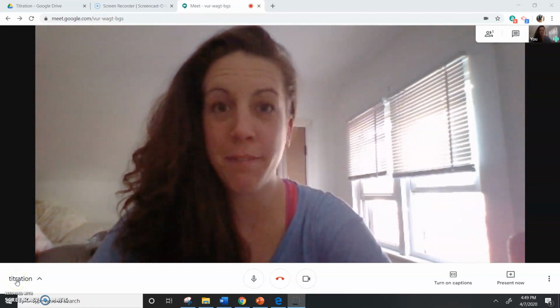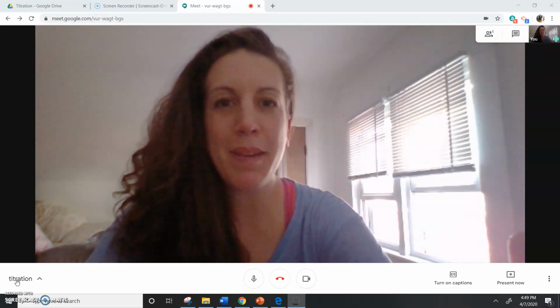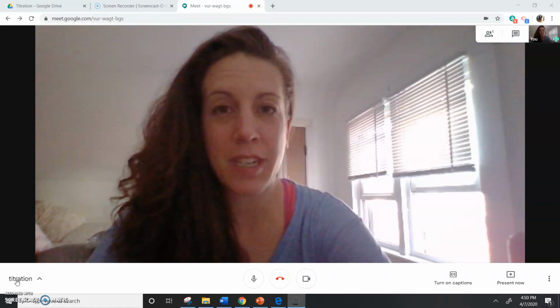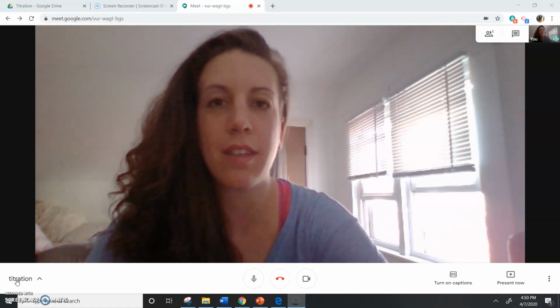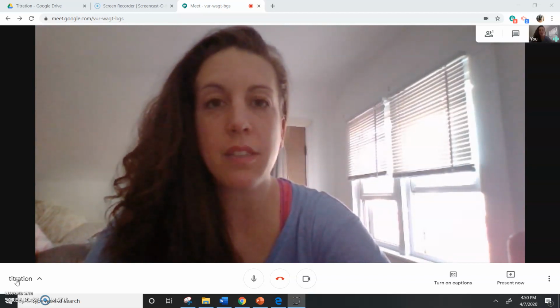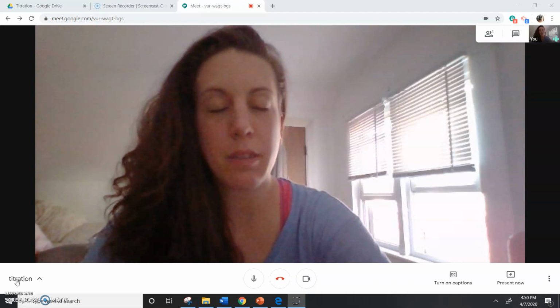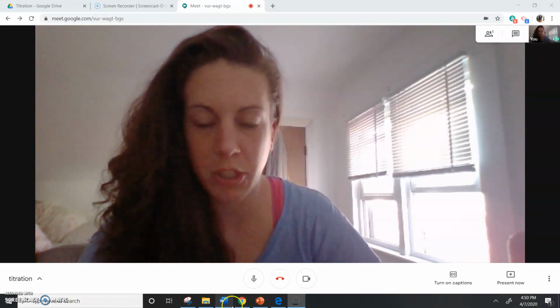Welcome back for another very exciting edition of Online Chemistry. Today we're going to be talking about a laboratory technique called titration, and then a mathematical calculation that goes along with that. So I am begging you, please watch this video to the end. The Let's Practice problems will help you when you get to the assignment portion.